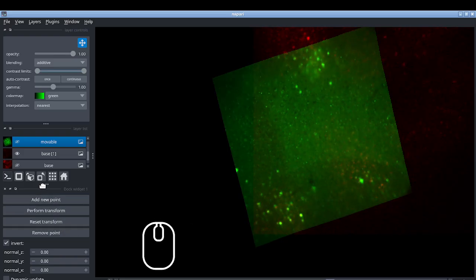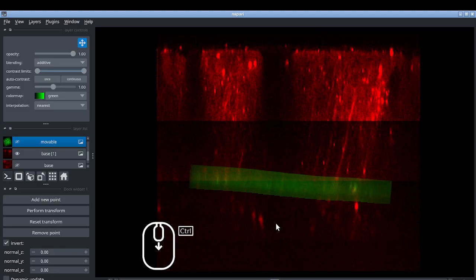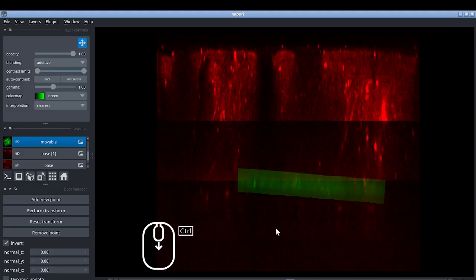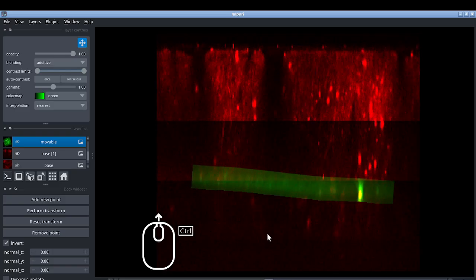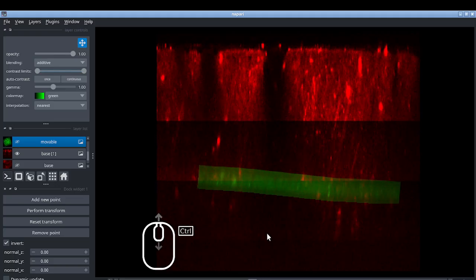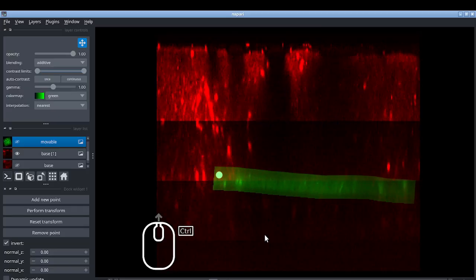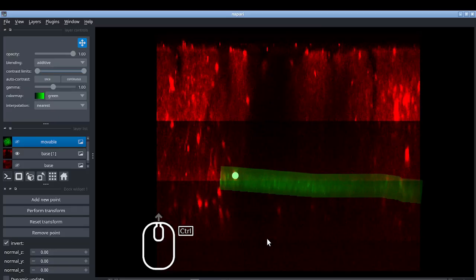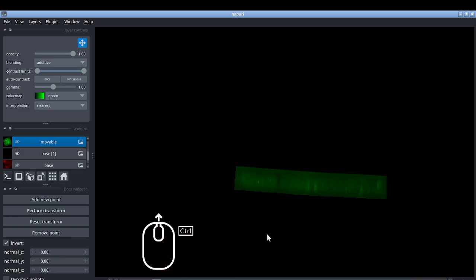Looks fine. Let's look at this side view, looking for something that looks mostly smooth. Yeah, it looks pretty good. It looks pretty smooth. I don't see any rough edges. Yeah, I'm happy with that.